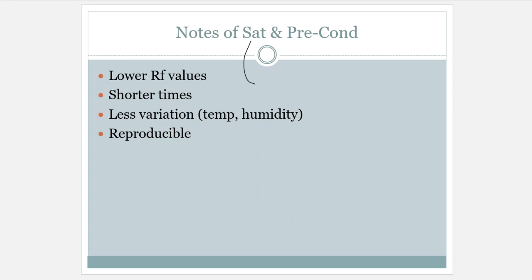So for us, we're going to see a lot of saturation development. Very often do we see preconditioned. We probably will pull in one just so you can see how that process works. But saturation, absolutely. So this is the idea. Again, we allow the tank to become saturated with gas phase from the developing solvent. So that way, when I put the plate in, that gas phase is already generated. It's already there, ready to go. So that way, it's going to help improve the reproducibility of our separation time and time, day after day.